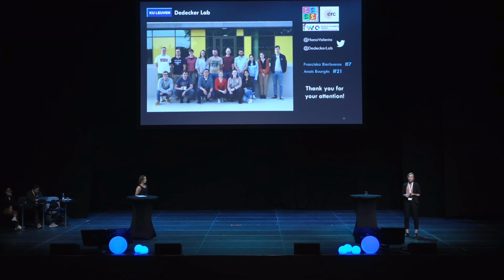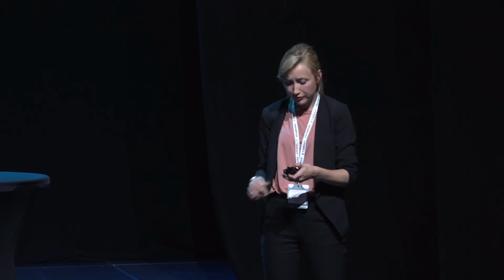Thank you very much. Fantastic idea. But it looks like it's just a beginning. Your 4 patterns of illumination look also relatively crude. Probably you could do it more comprehensively, and maybe on the detection side, use some kind of artificial intelligence to distinguish between the patterns. What do you think? How many different fluorophores could you distinguish?